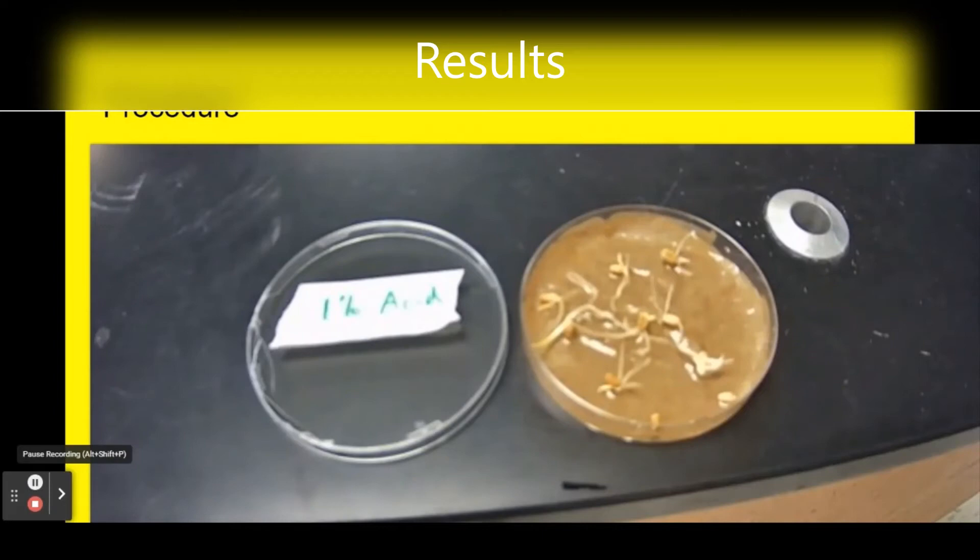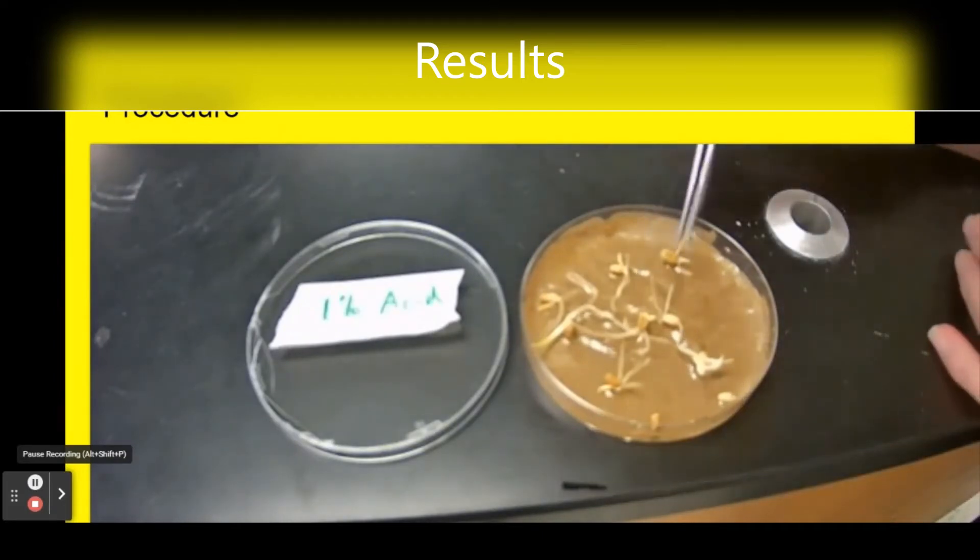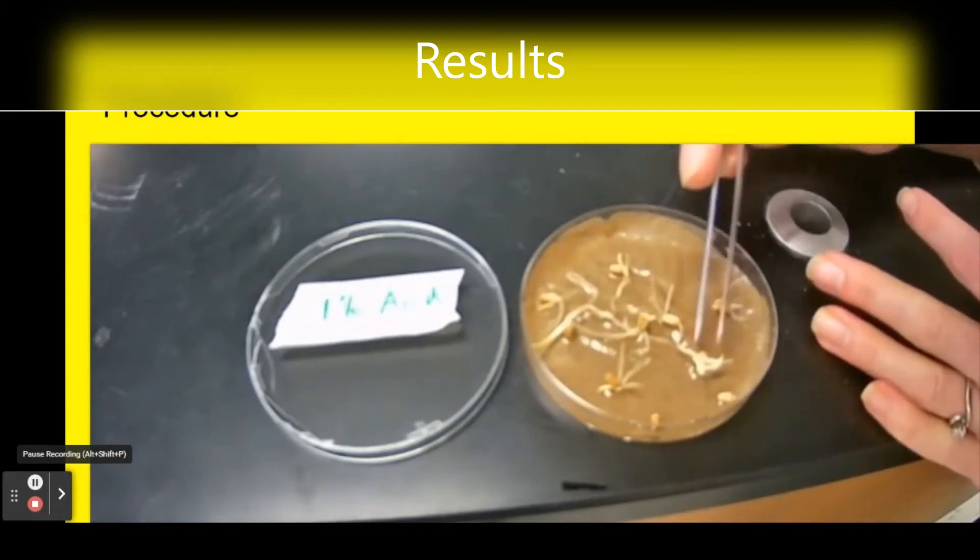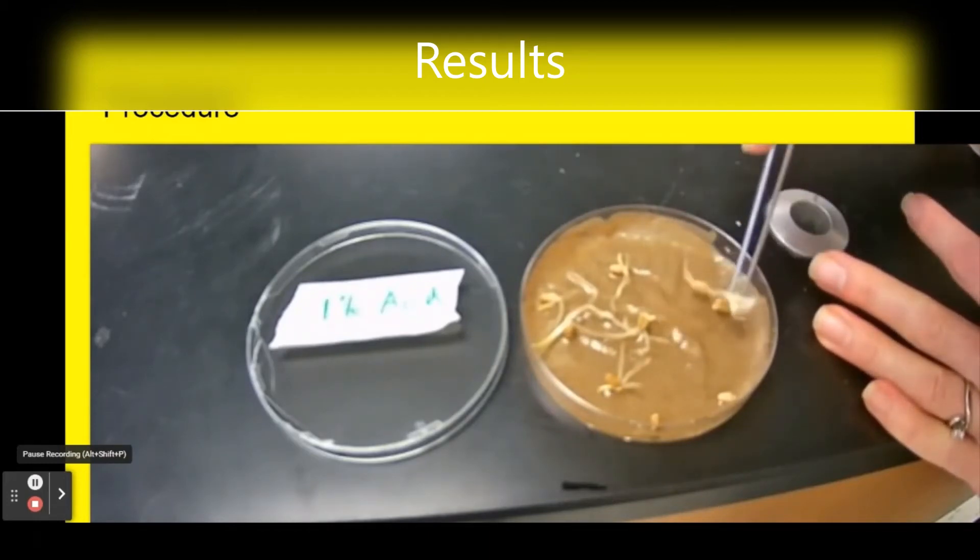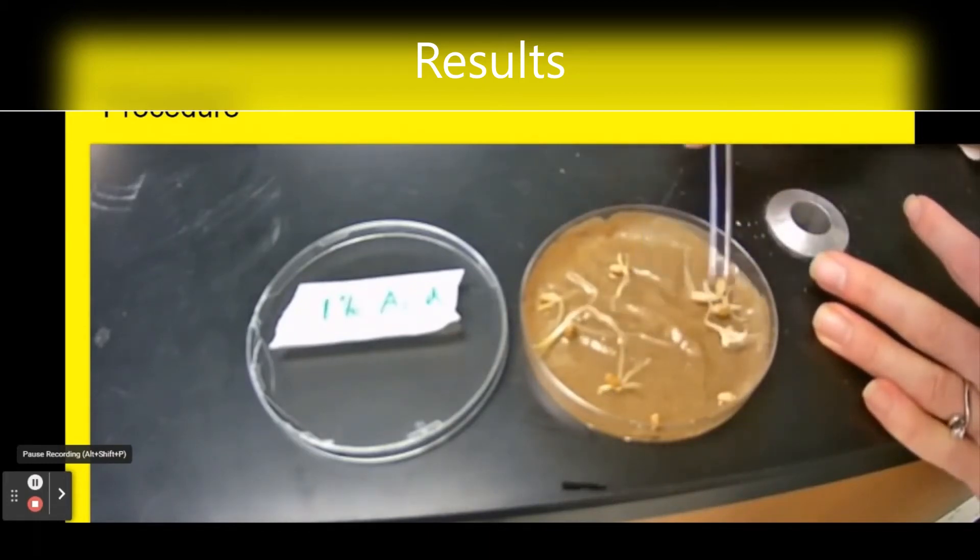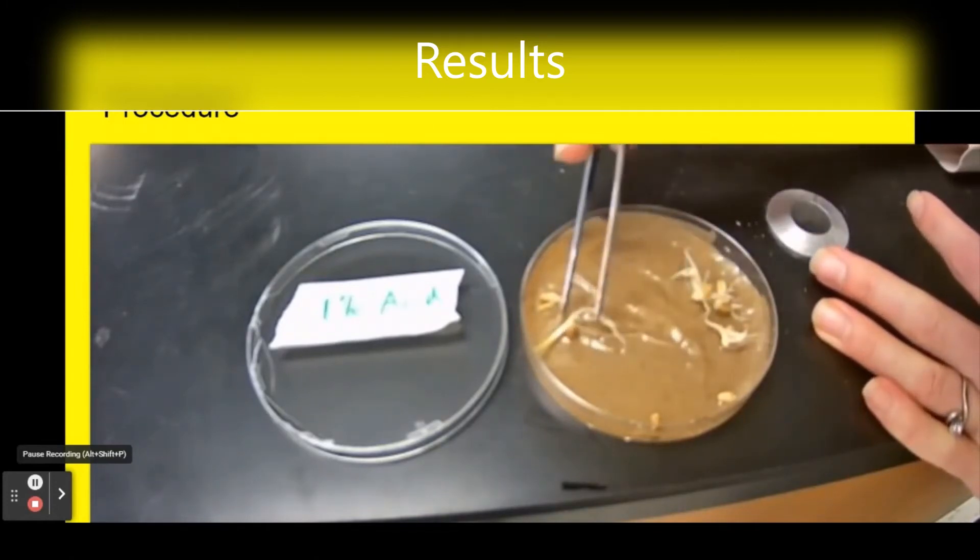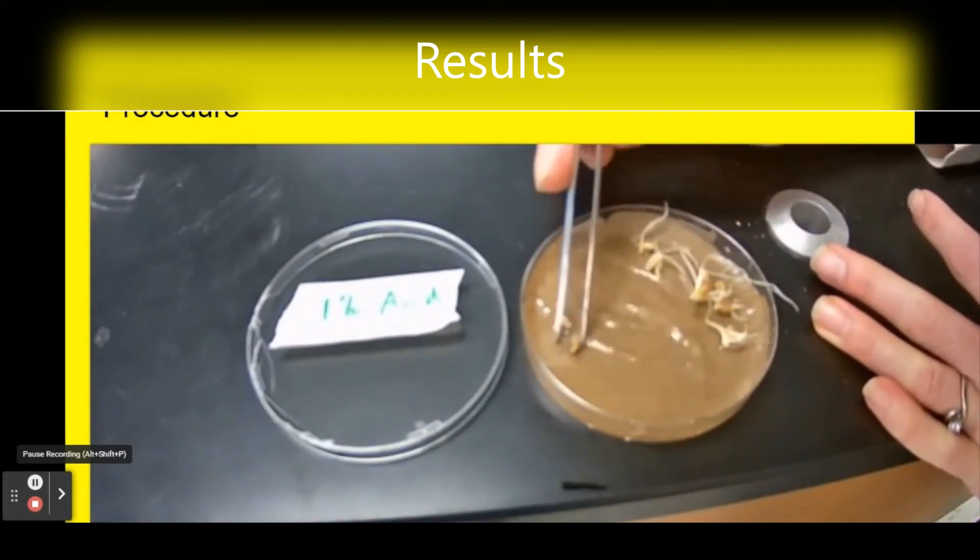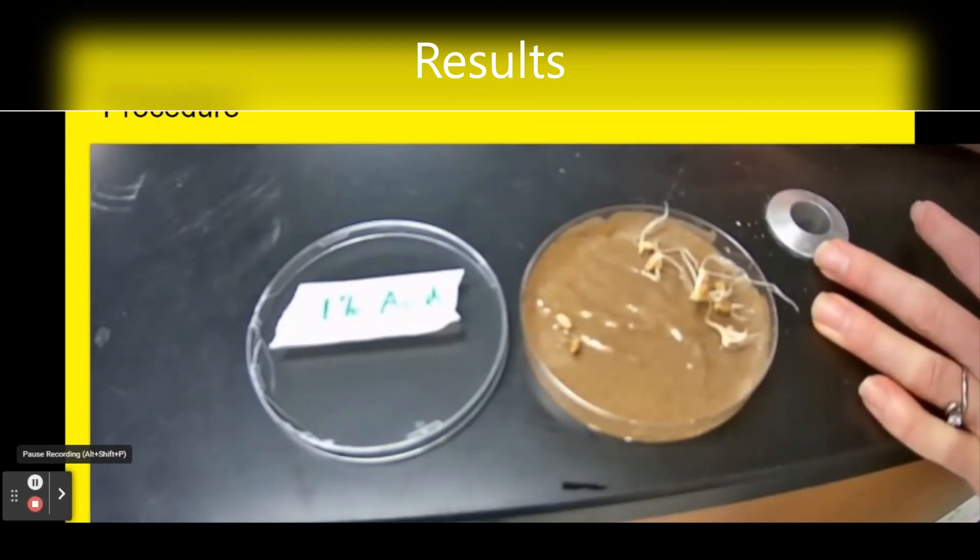Here's the results for one percent acid. I have one, two, three, four, five, six, seven, eight that germinated and I have two that did not.